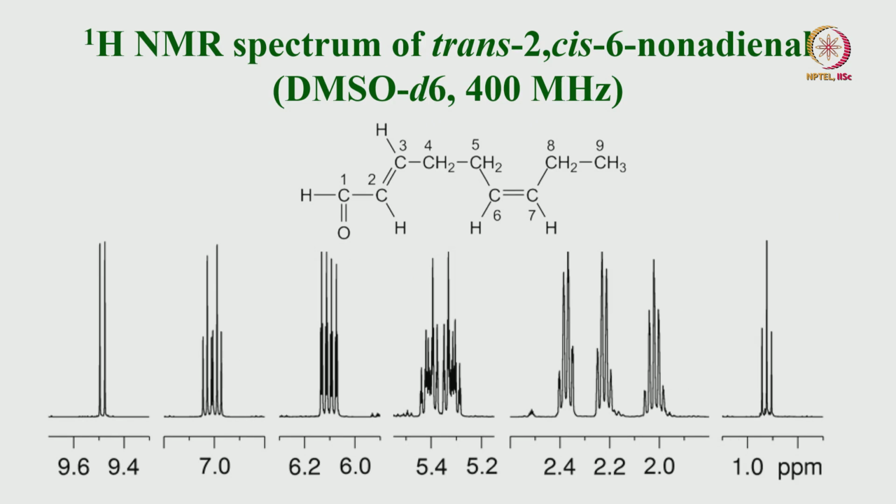This is the molecule, a very interesting molecule. There is no phenyl group here. When there is no phenyl group and only aliphatic groups like this, the spectrum is very difficult to analyze and extract the information from, but easy to make the assignment of protons. But if you want to analyze and get the J coupling, it is not easy. It takes a lot of time, more involvement is required.